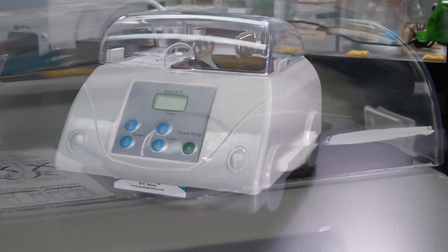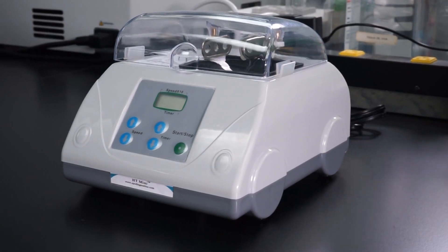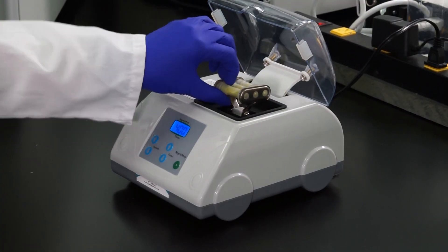The machine itself is relatively inexpensive and the perfect choice for homogenizing in the field. It can even be powered by a car battery inverter safely and easily.